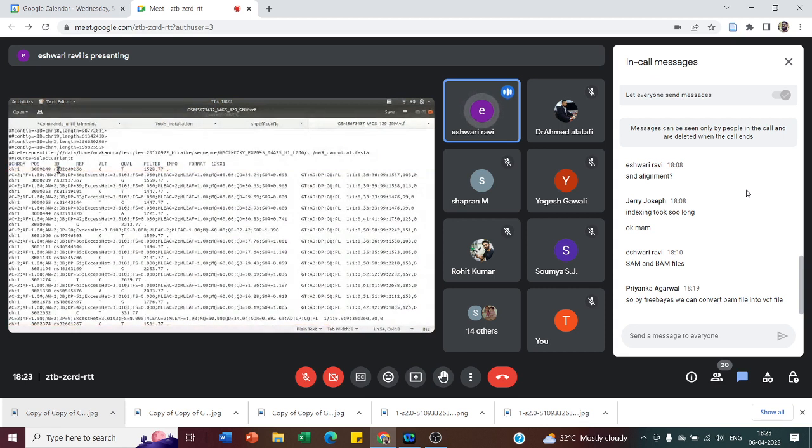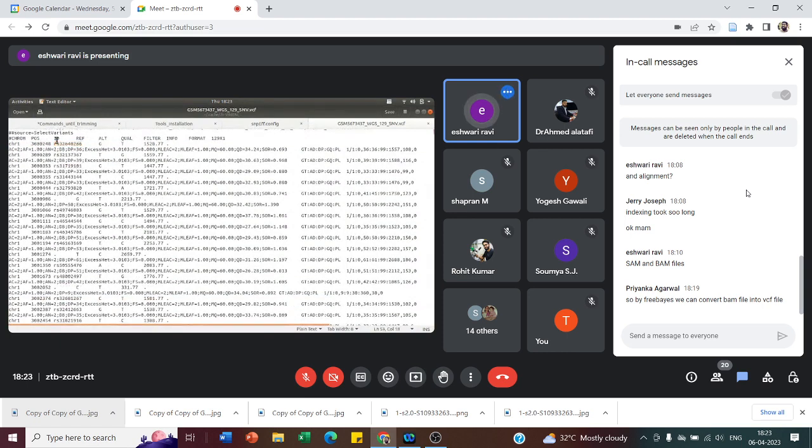You can always use these IDs for further downstream analysis and determination of its properties and gene symbols, etc. You can copy them and paste them in NCBI, PubMed IDs, protein DB IDs, and you will get information on whether this altered nucleotide is of a gene or a protein, or what role it plays, etc. It will all be there in the other genomic databases. So this is the basic information and how to interpret your VCF file.